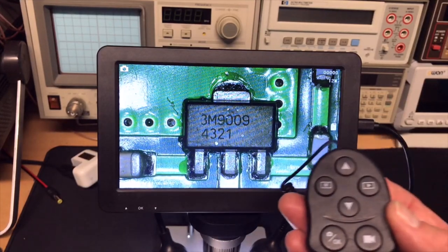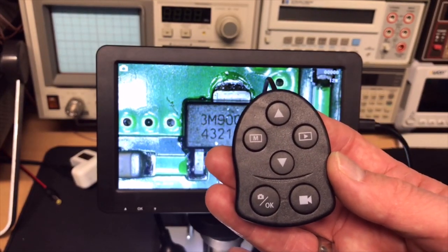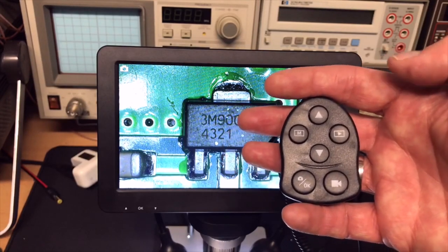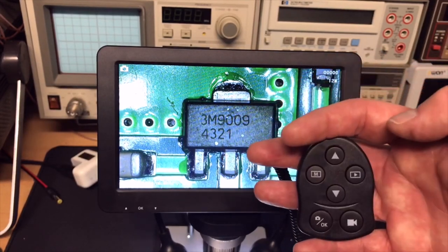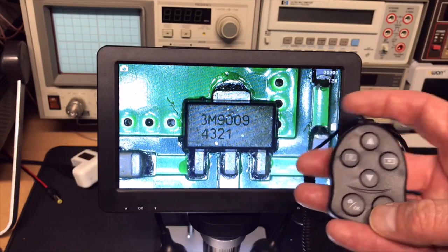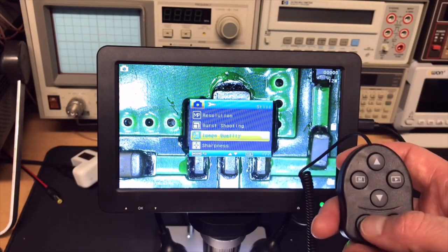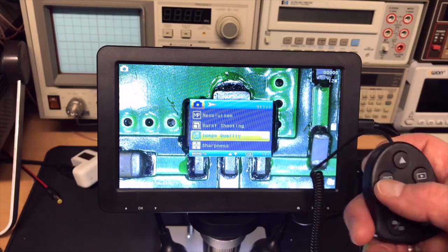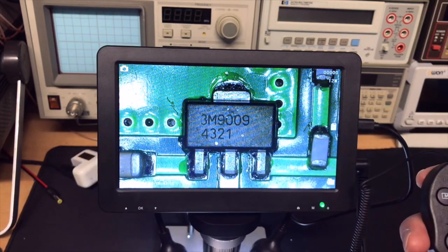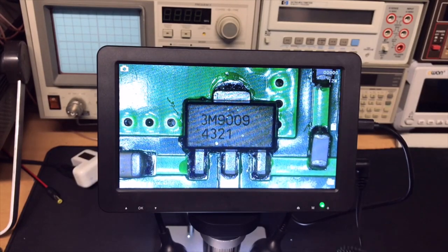Yes, and I'm going through the menu just with this little remote control. So you can see the OK button is also the picture snapshot, to make a shot to the SD card, to start your video to the SD card, up, down, and the menu. So it's this menu. You step through it, you click OK if you want to change something, and menu is also from here to here. And again, menu, you also exit. So it is kind of straightforward.